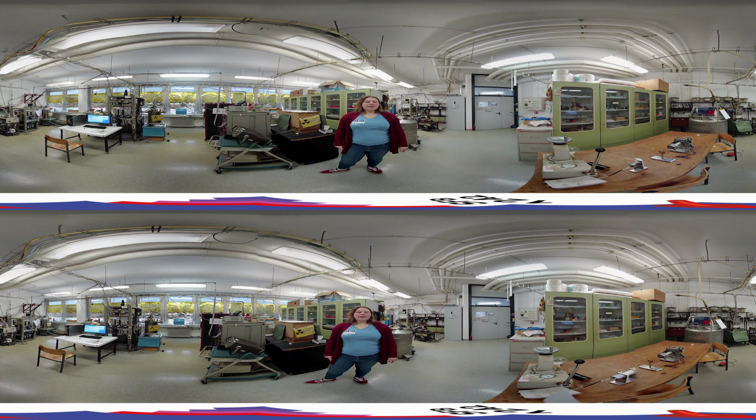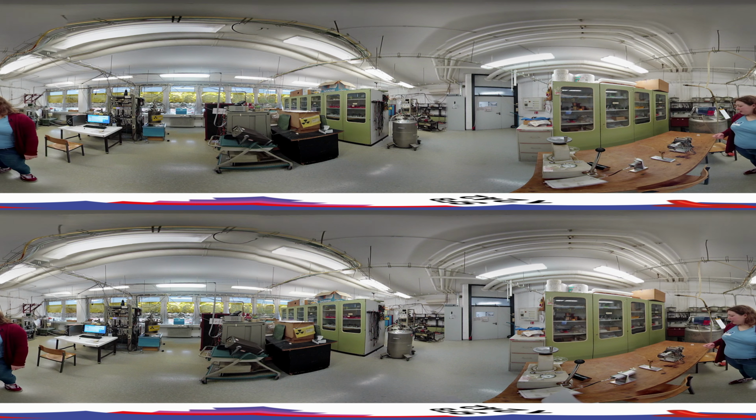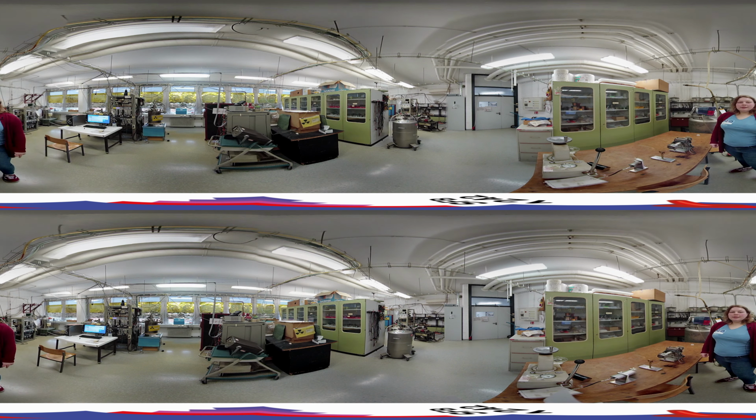Depending on the electronic and magnetic interactions inside our sample, we need to tune the energy of the gamma rays via the Doppler effect because they can change the nuclear energy levels of the iron atom. If the energy equals the energy gap in the sample, the gamma rays can be absorbed recoil-free.